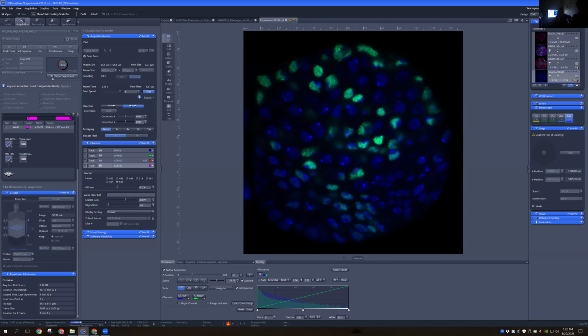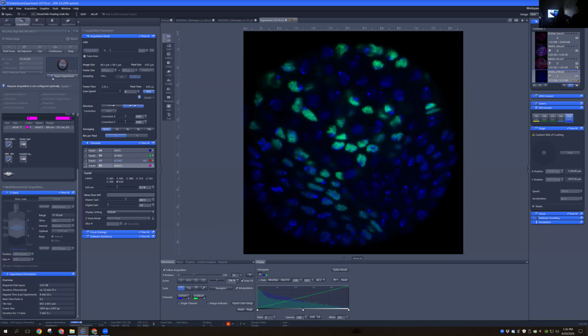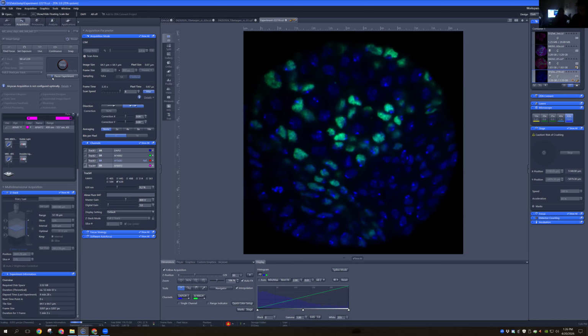But it does bring up the point that these fly organs that you're working with are really quite small. They are. And you're like one of 5 people in the world who can do this, right? So basically this technique is called a larval ovary dissection, and there definitely are not that many labs that do this.